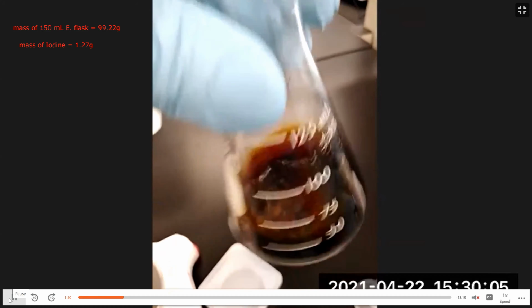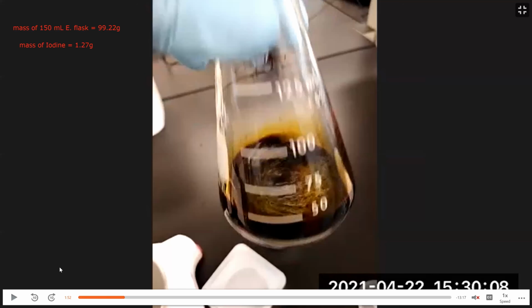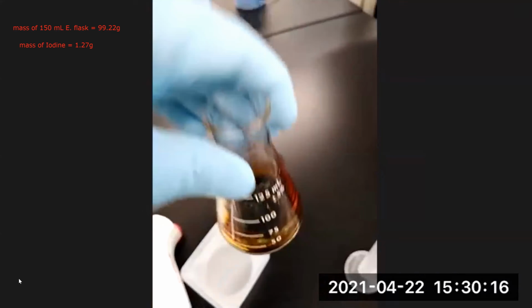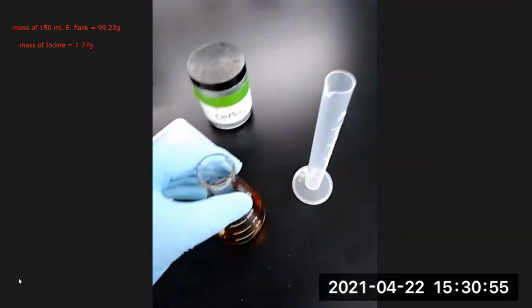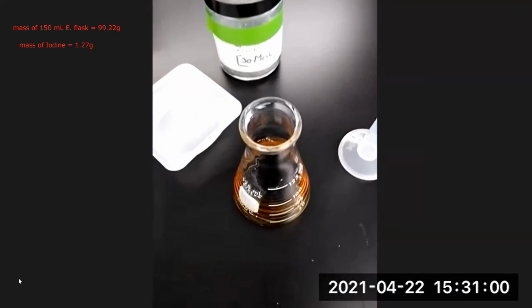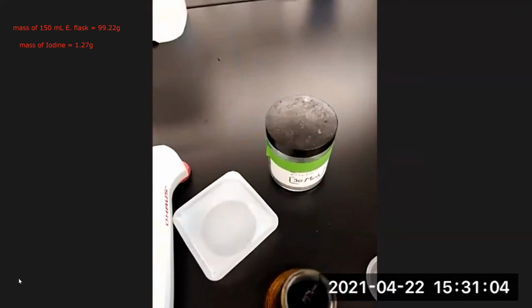And so it's going to be a dark brown color initially. So the initial color, very dark brown color. So we measured out our iodine, we added it to the Erlenmeyer flask. And now we're going to measure out the zinc mesh and add it to the flask as well.